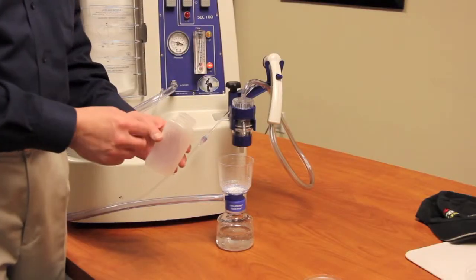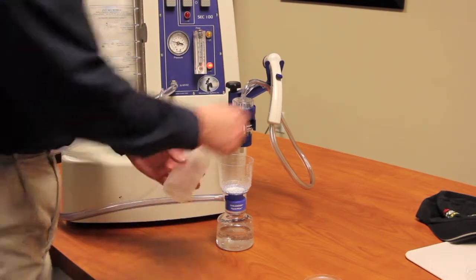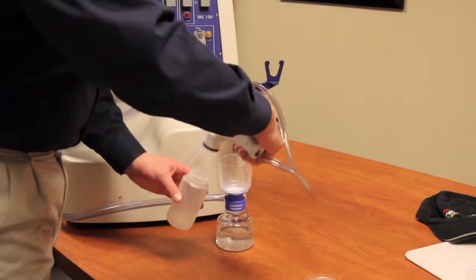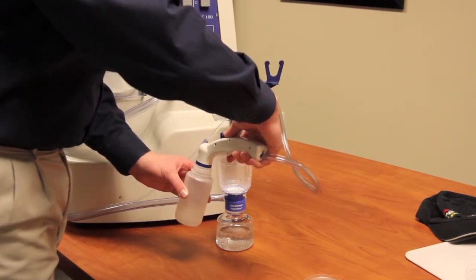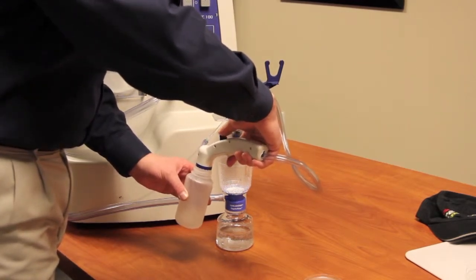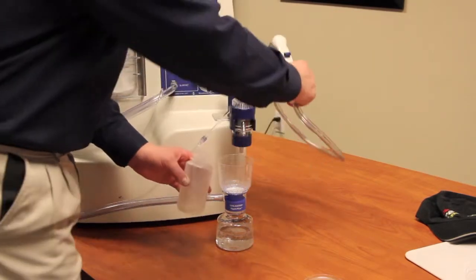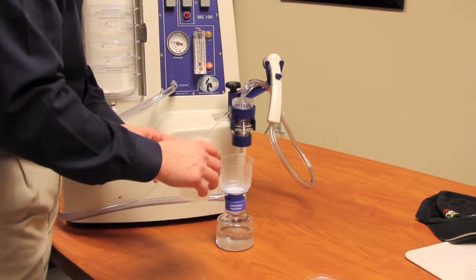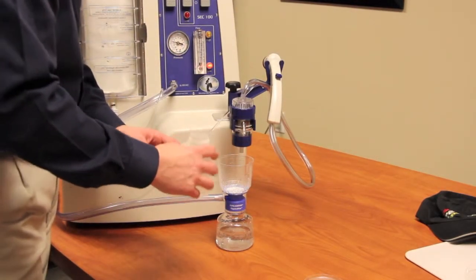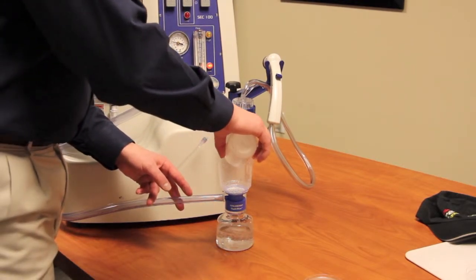So if you're concerned at all about any DNA material still being in the bottle, you can take the sampling head and spray it directly into the bottle. Get 10 or 15 mils in there. Swirl it around. Get up there on the sides, and again pour it through there.